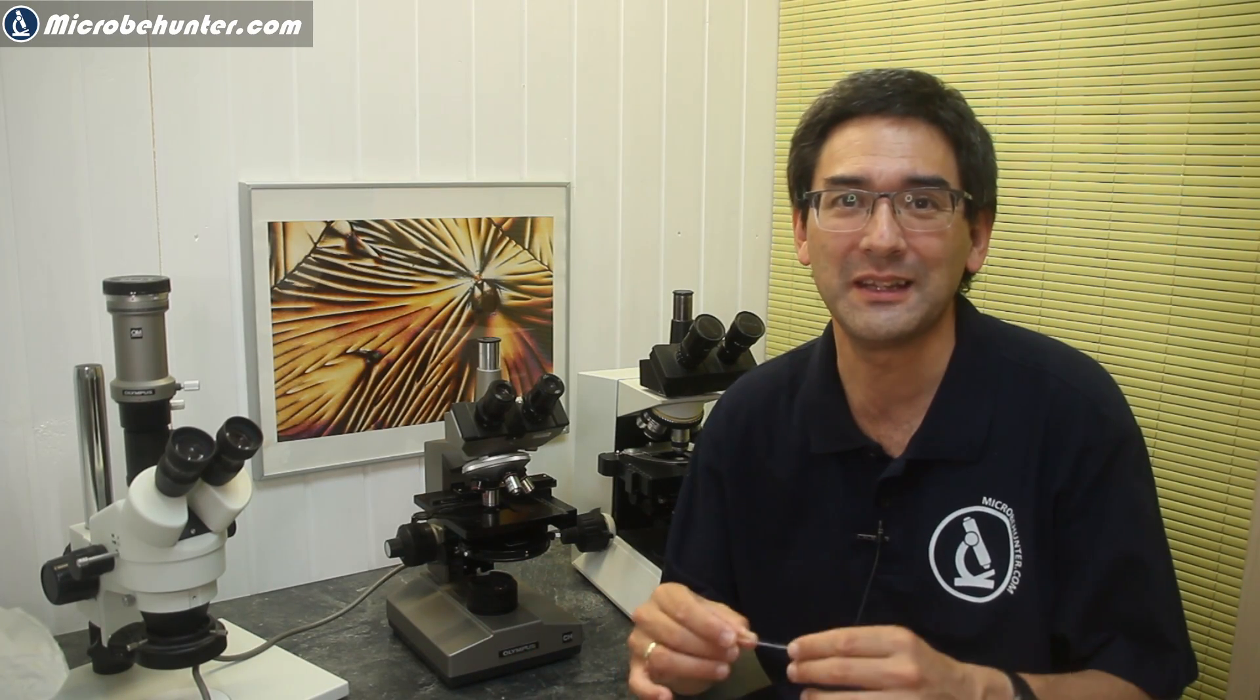Hi, Microbe Hunter here. One of my viewers recently asked me which microscope slides and cover glasses I recommend, and I think that's a good question. In this video, I'd like to give you a short overview of the different types of cover glasses and microscope slides, and then at the end I'll give you a recommendation.